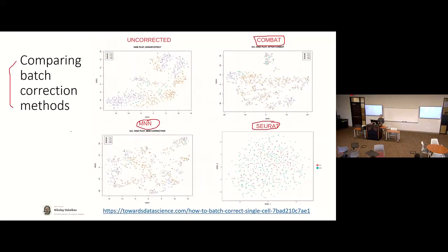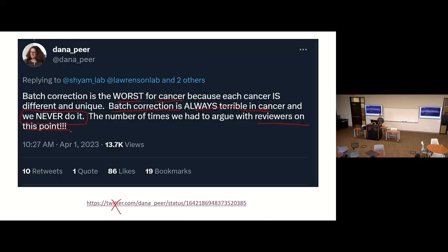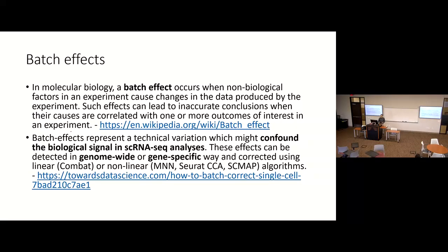It's a general belief that you need to do the batch effects correction before you can move on. So the reviewer just asks, have you done the batch effects correction before you do anything? Anyway, even as we discuss the technology, you can do it, but you have to ask why you are doing it. Let's see what we can do.